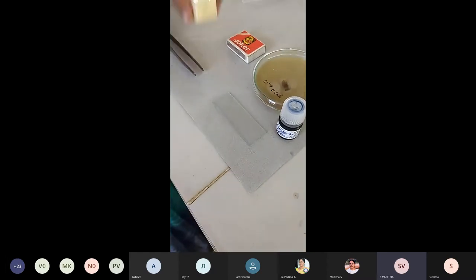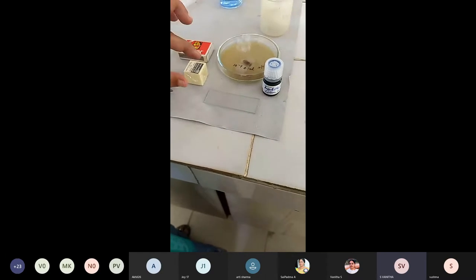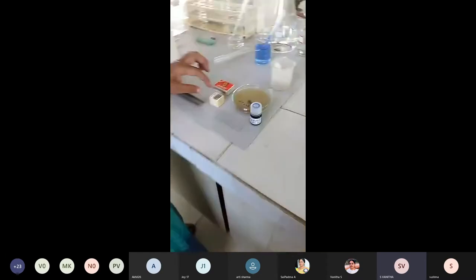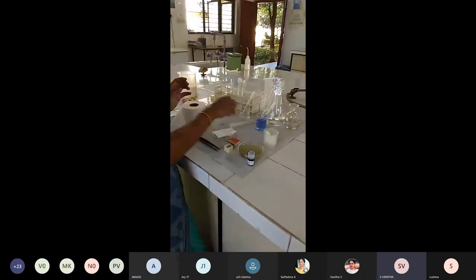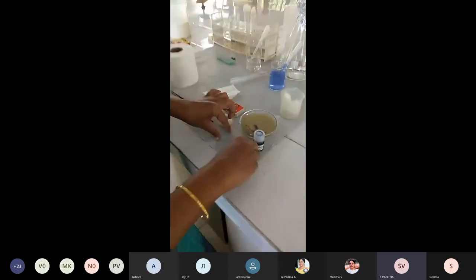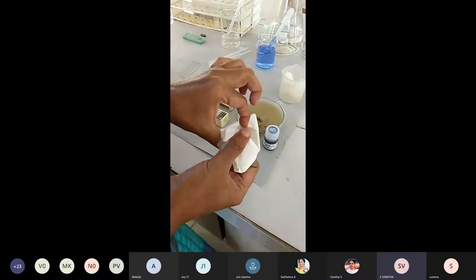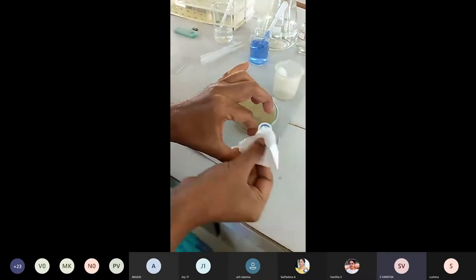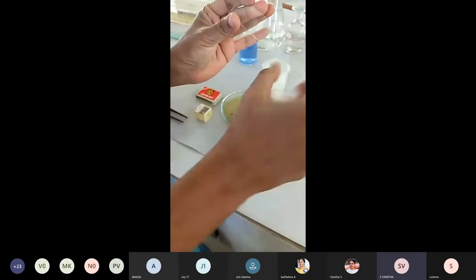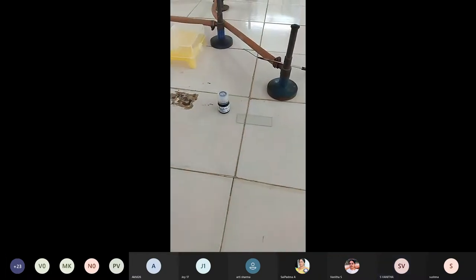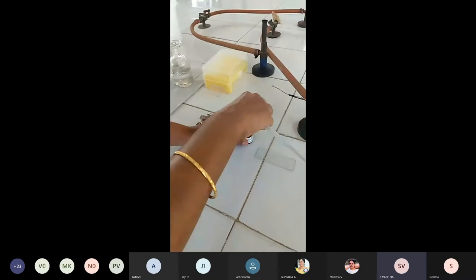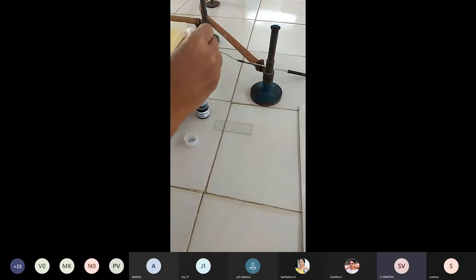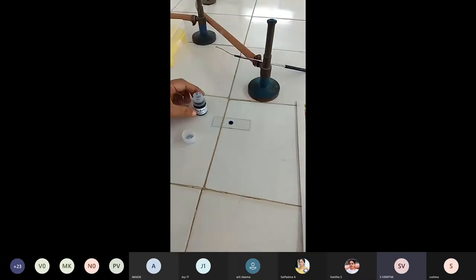Then using a coverslip we are going to place a coverslip on top of the sample in such a way that there is no any air bubbles which are going to be there on the drop plate. So let us do this one. First we will take the glass slide so it must be clean. There must be no any dust or any unwanted contaminants on the slide. They may disrupt the observation. Let us clean the slide thoroughly and then we will place it here. This is Lactophenol. Now the first step is to the slide we will drop first the Lactophenol to the center. Just take one small drop and then you can put it to the center. That is more than enough for us.